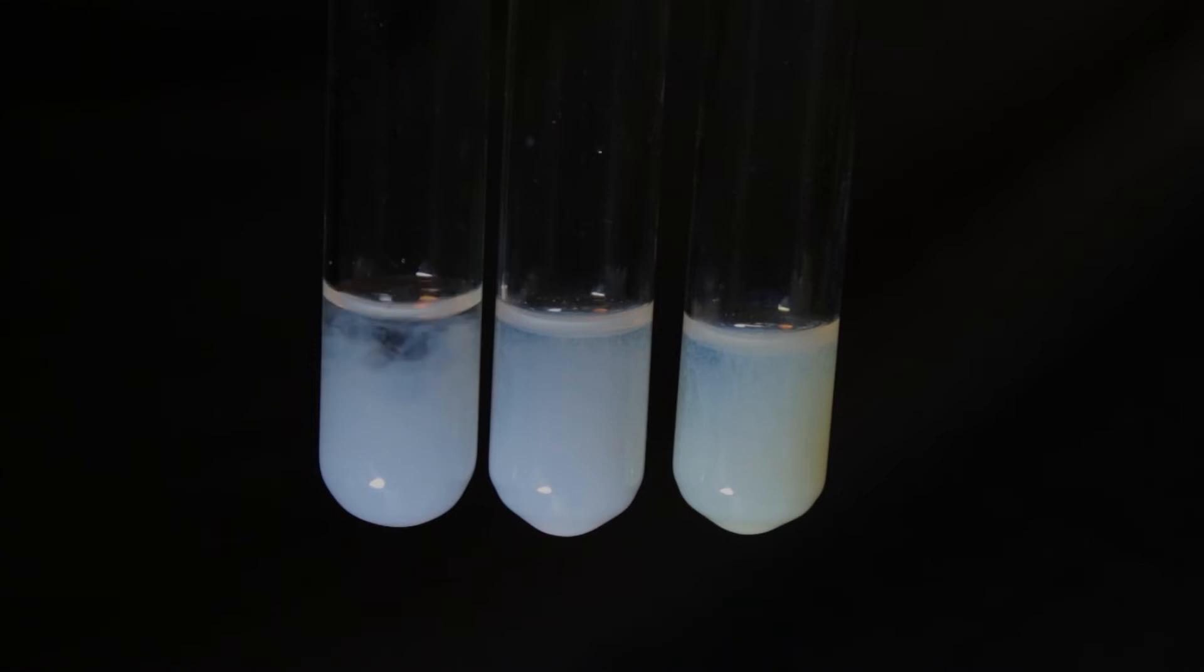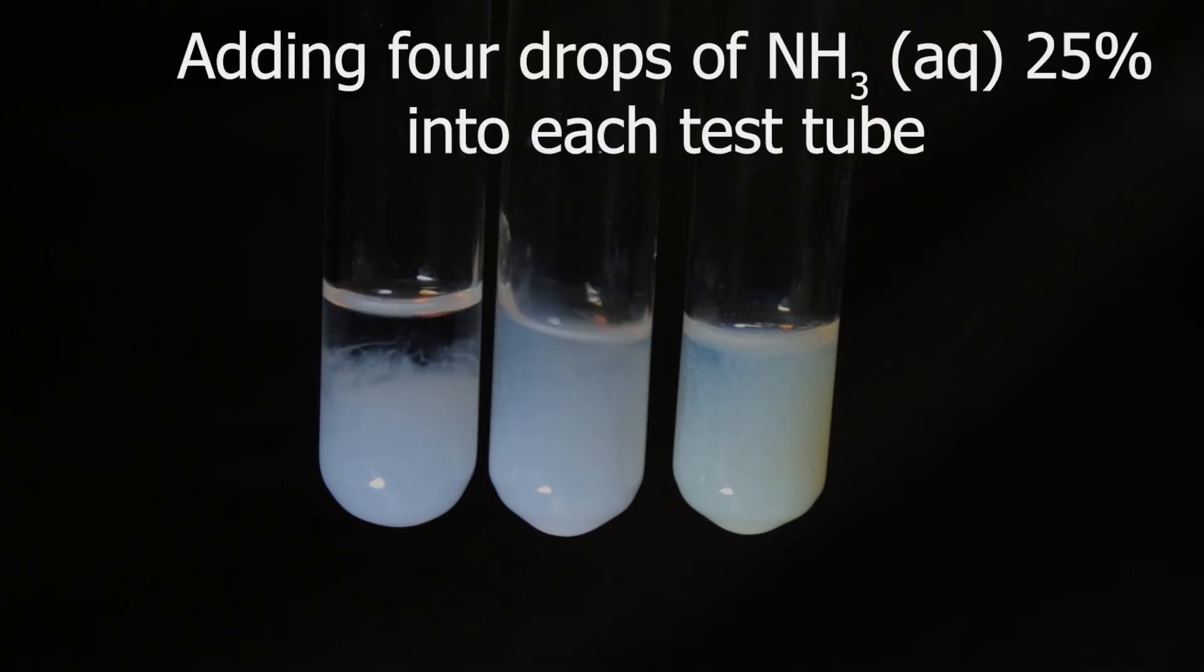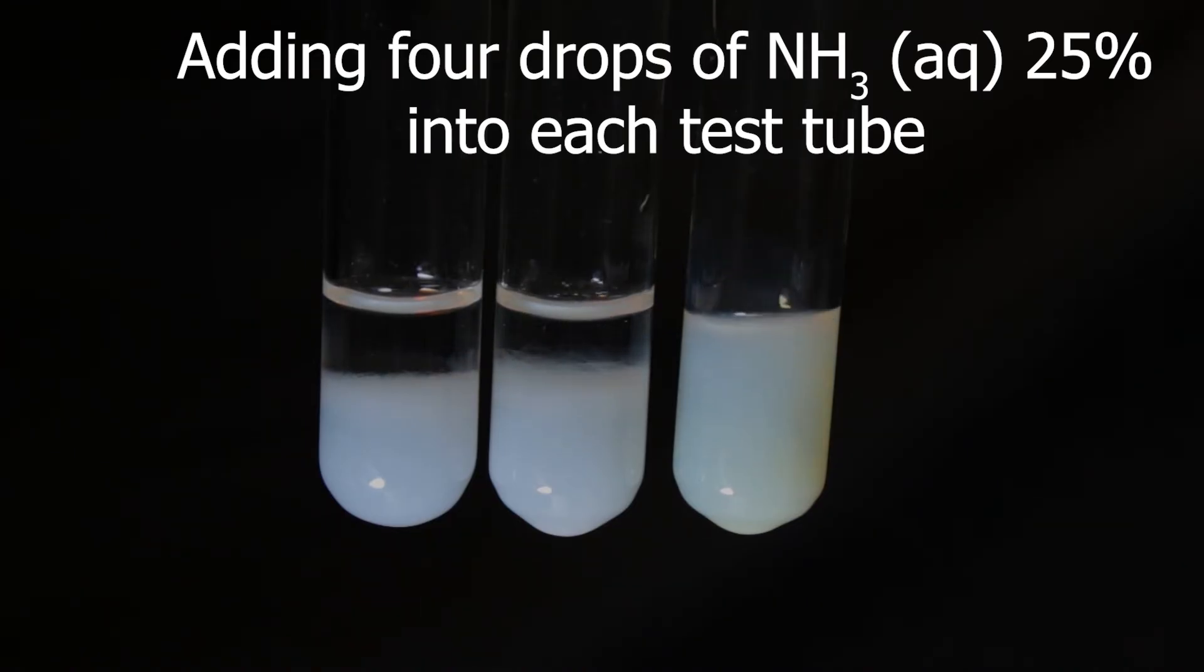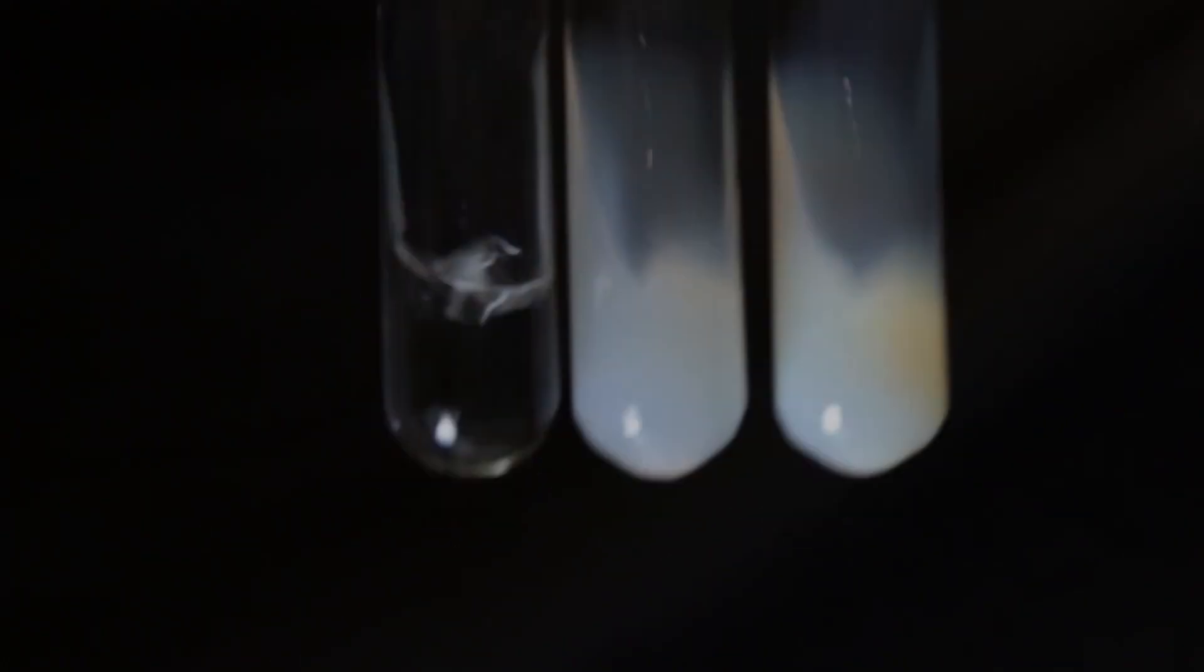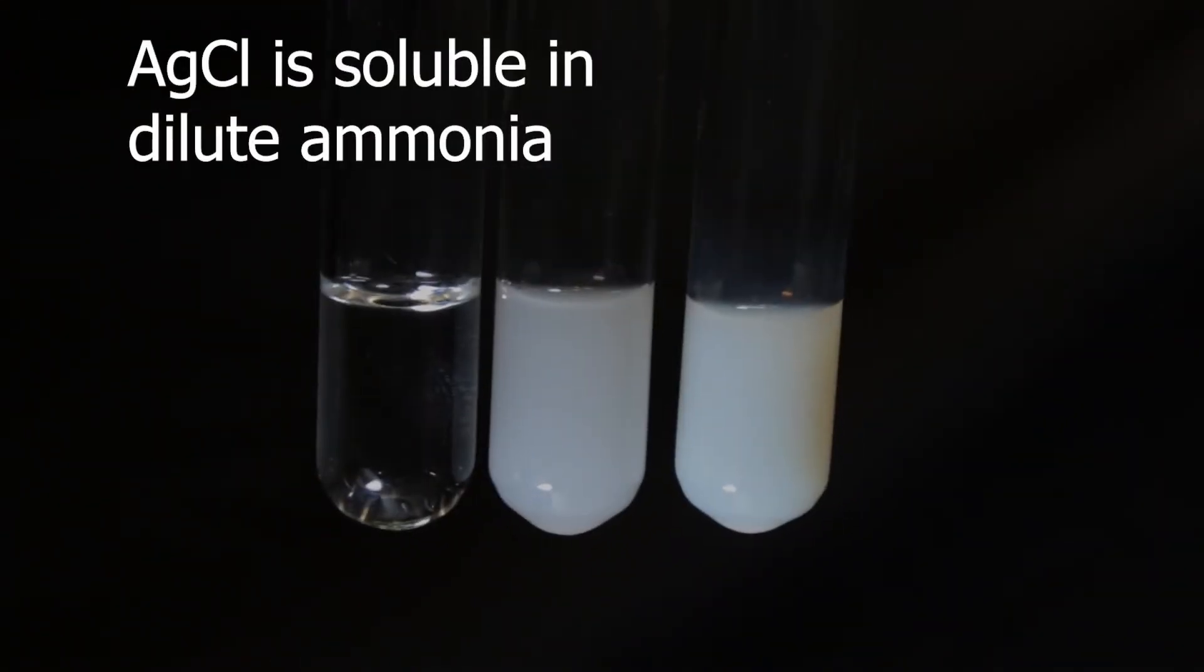Here I'm adding ammonia. You see, there is some effect in first two test tubes. Let's see how pronounced it is by shaking. Silver chloride totally dissolved. It is soluble in dilute ammonia.